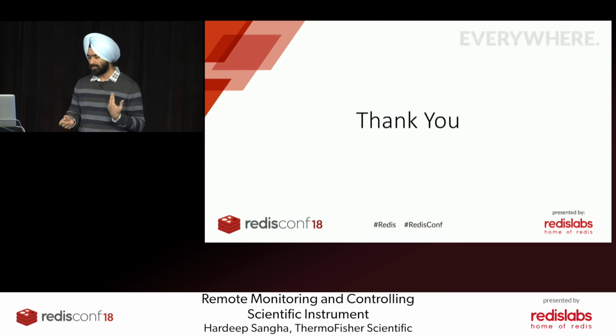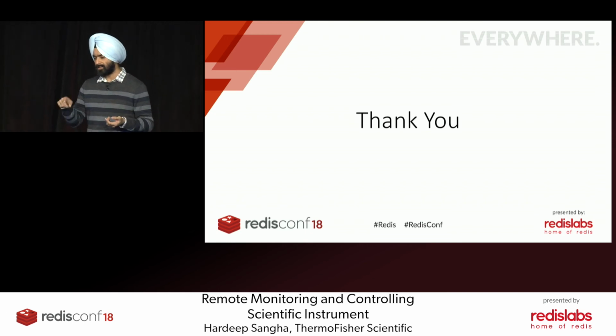And PubSub we also use for other things. For the analyzed files we get on the instrument, for performance reasons, we don't pull everything from S3 all the time. Once you pull something from S3, we try to cache it locally on our compute instances. Then when a plate remove event comes or the cron runs at night, we send a message saying that this needs to be deleted, so we delete that temp storage at that time as well.